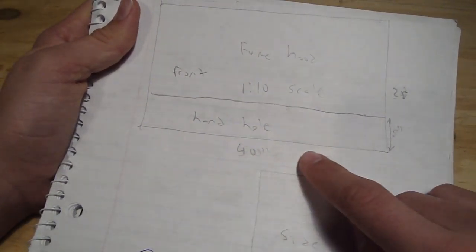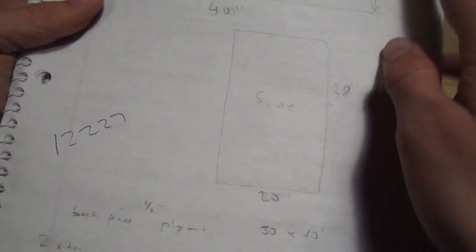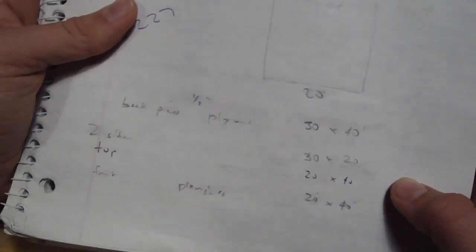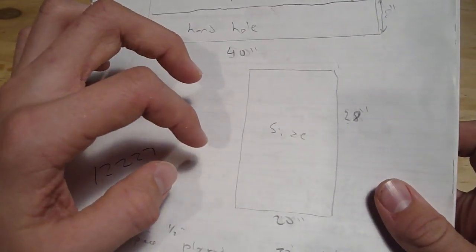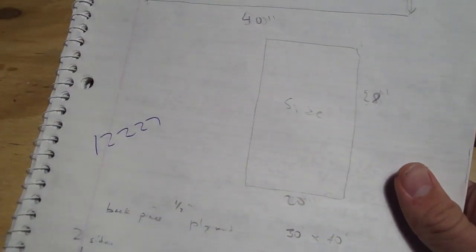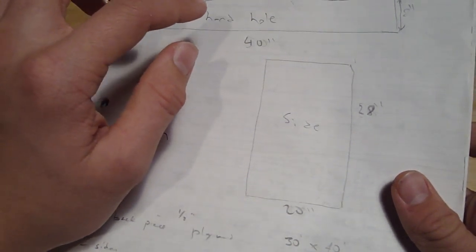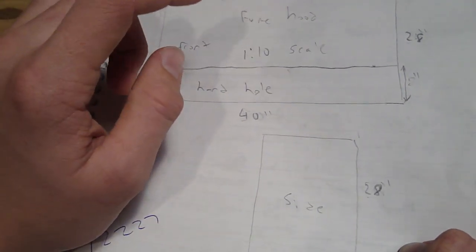That should be tall enough to do most experiments, including dropper systems and so on, and it'll be 40 inches long — you have to have it long enough to do distillation and condensers. The sides are going to be 20 inches wide and 28 inches tall. So you're going to need two side pieces that are 20 by 28 inches, a back piece that is 28 by 40 inches, and a top piece that will be 20 by 40.